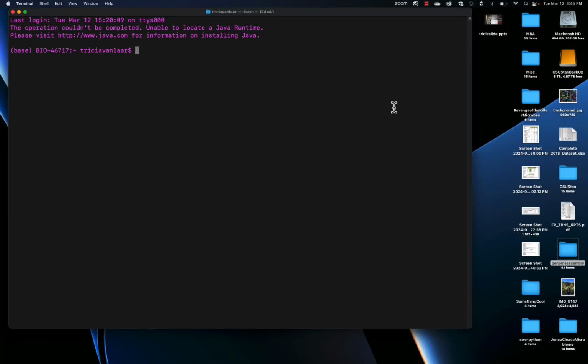Okay, so here I want to show you again how you can do the genome assembly using that program ABySS, working through your command line. So remember the first thing that we did, and if you weren't able to do this in class, you can do it now. Mamba create name, and we created an environment in Mamba called genome assembly.